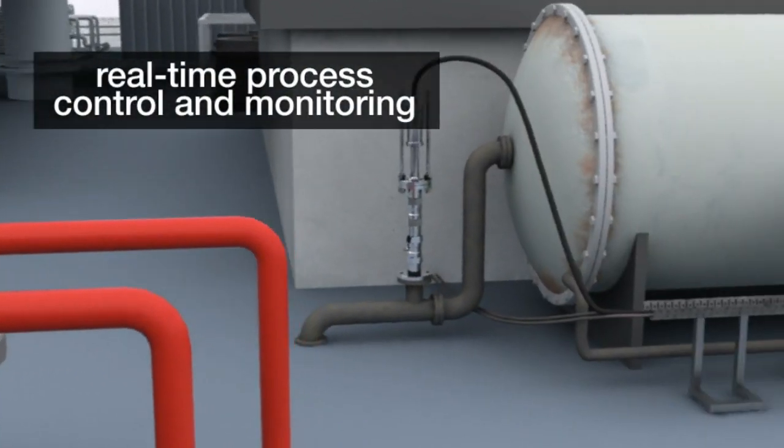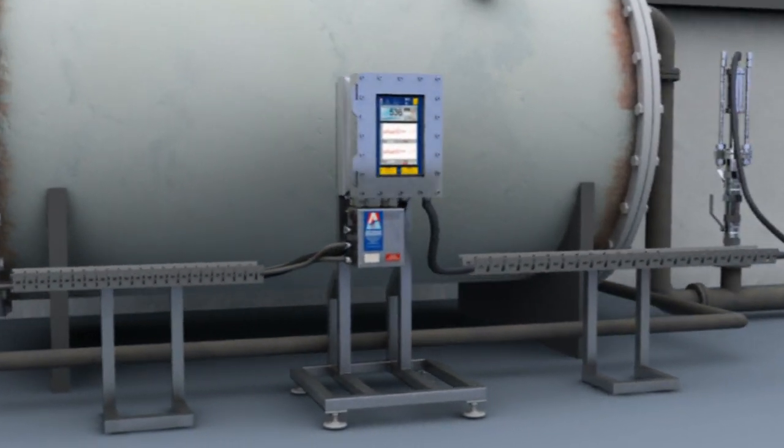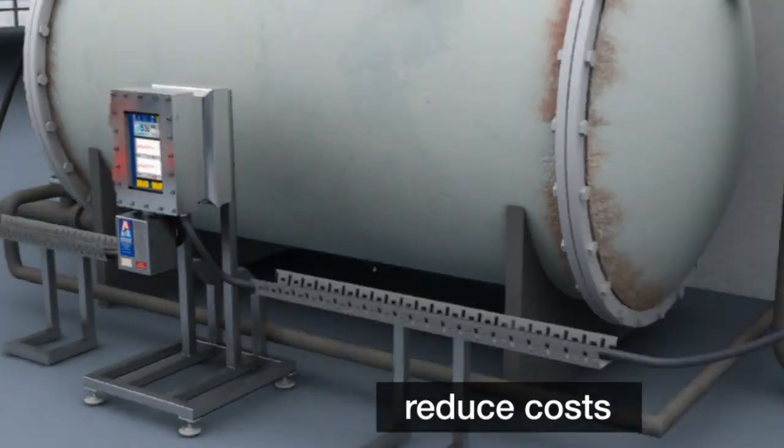Real-time process control and monitoring allows you to optimize processes, report on process issues, and reduce costs.